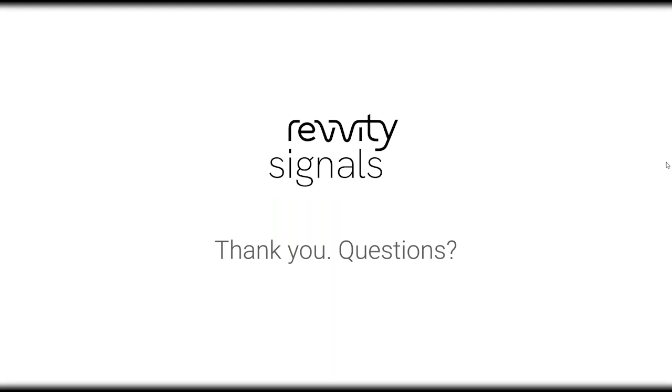Alrighty, thanks. So first things first, we're going to get to the one that required some clarification for Jensu. Can the different fields have a template mapping for different values when importing into the external enumerator, so you don't have to do it on every experiment? So if you're doing the same type of thing over and over, can you just have it be like a sticky type of value? Precisely. Yeah. And so the answer to that is no, not right now.